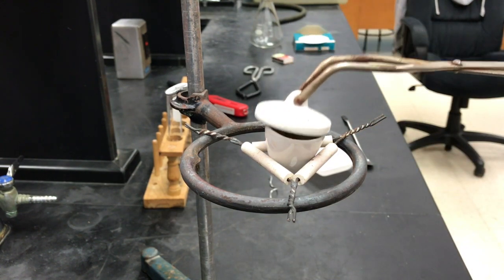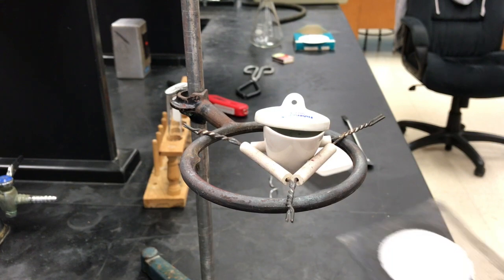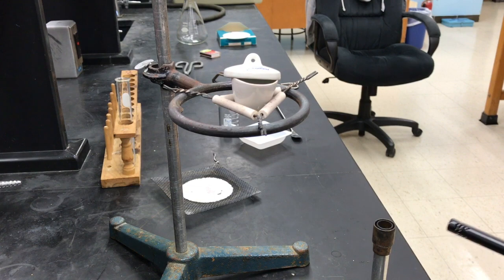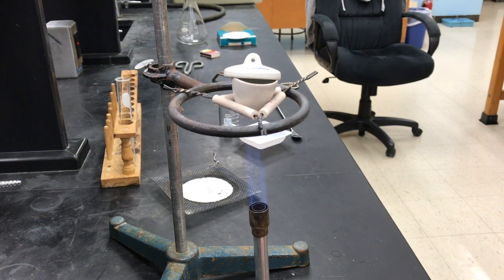Now I'm going to put the lid on, but leave it ajar. Remember, we need to dehydrate this, so the water's got to be able to leave. And then I'm going to put it under a very gentle flame so that I can pass it back and forth. I don't want to heat this too strongly. So let's turn the flame down by adjusting the gas. And I'm going to heat it like so for maybe somewhere between 5 and 10 minutes. We'll see how long it takes. I'm going to be looking for a color change. We started off with a teal blue-green color, and after it's dehydrated, it should turn brown.